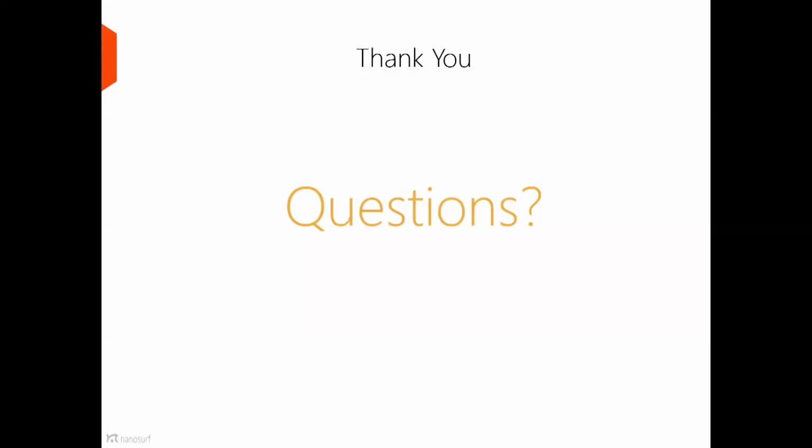That's a great question. I think it really depends on what your research is. Oftentimes, if you get enough information from just a two-dimensional picture and you don't need that third dimension, then you don't necessarily care. But the third dimension is a great way to characterize differences between samples.